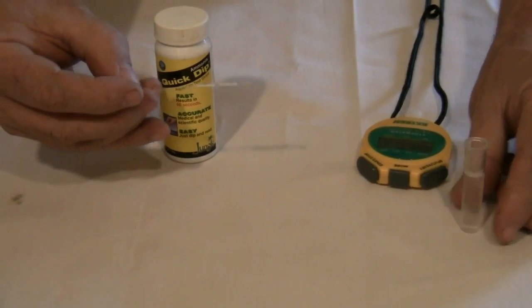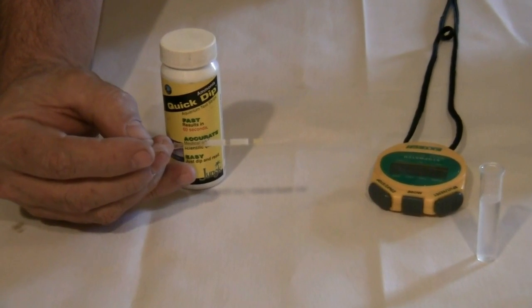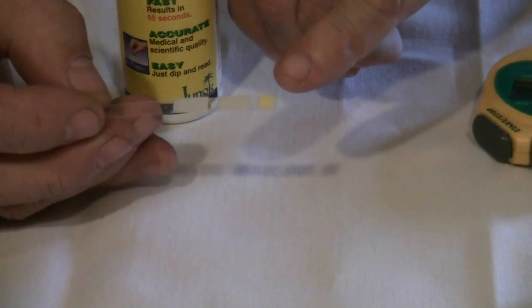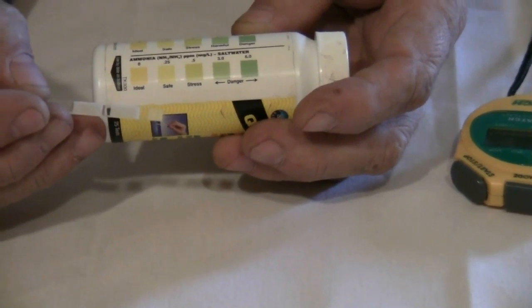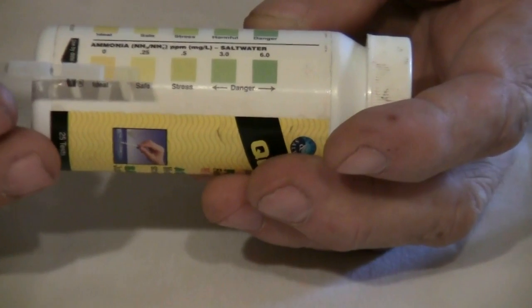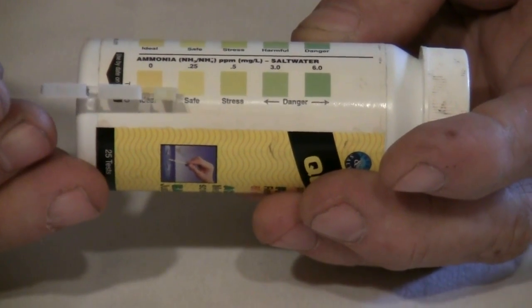Hold the strip pad side up for 30 seconds. This allows the chemical reaction to take place. After 30 seconds, compare the color of the pad to the color chart on the bottle. The color indicates the level of ammonia. In this instance we see the color indicates the ammonia levels are within the safety zone.